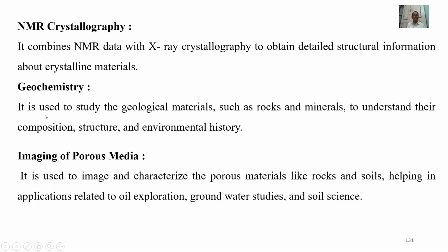Geochemistry. It is used to study geological materials such as rocks and minerals to understand their composition, structure, and environmental history. Imaging of porous media. It is used to image and characterize porous materials like rocks and soils, helping in applications related to oil exploration, groundwater studies, and soil science.